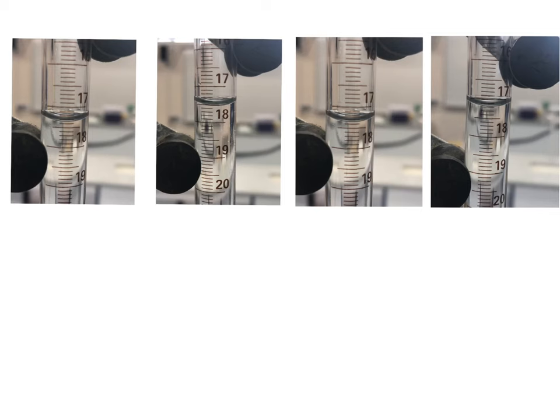So there are four examples here that we're going to look at. 1, 2, 3, and 4. So if we look at this one here, the meniscus here is between this line and this line here. So as we go down, this is 17.1, 17.2, 17.3, 17.4. So the meniscus is between 17.3 and 17.4. So the reading on this burette is 17.35 centimeters cubed.